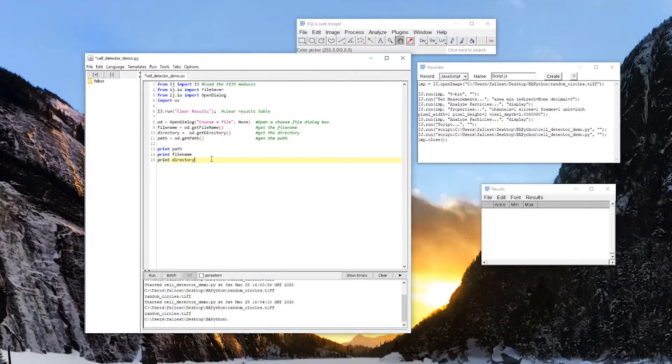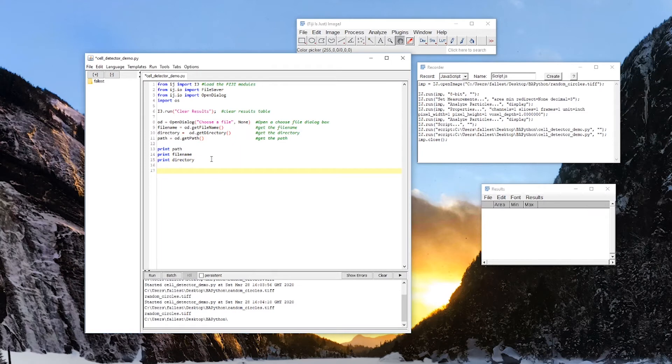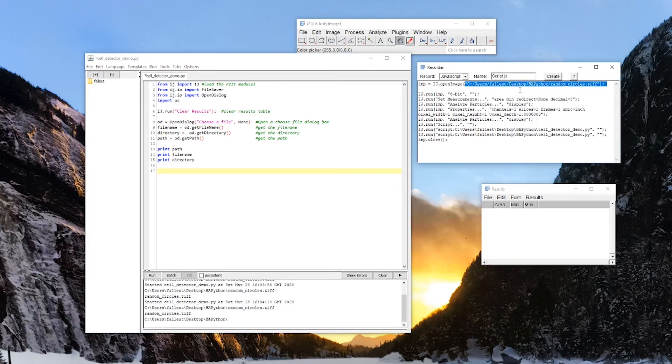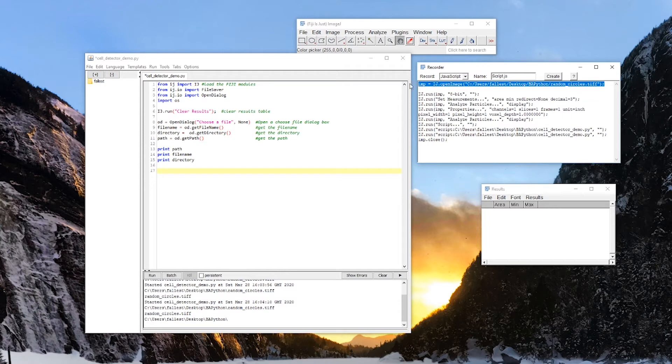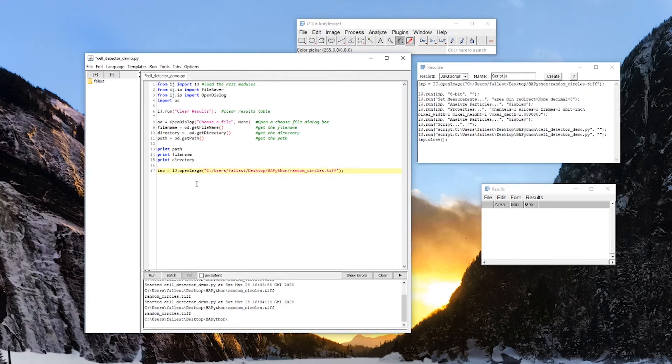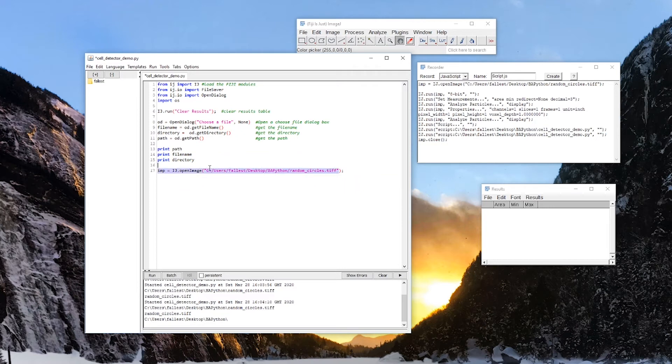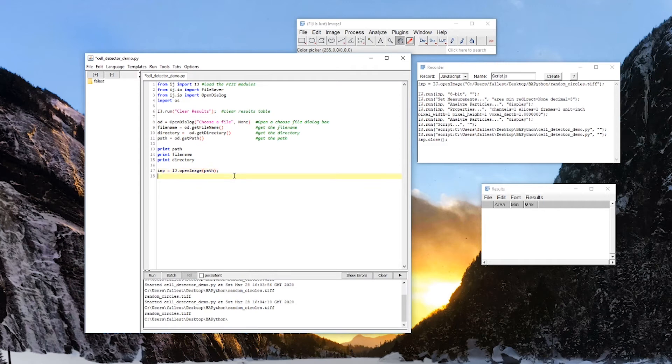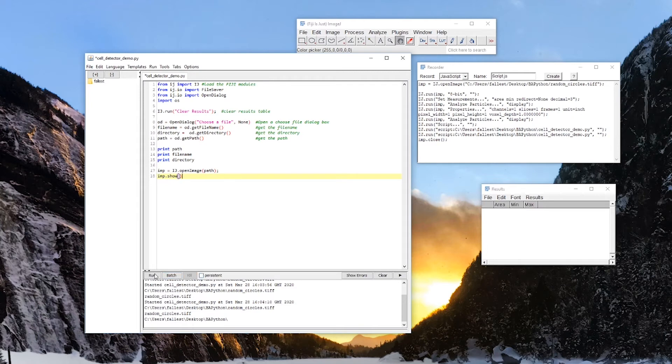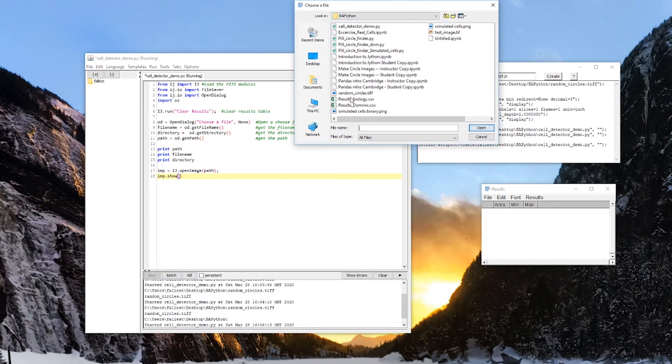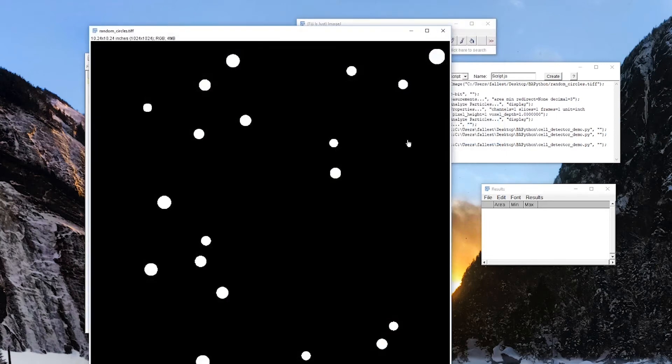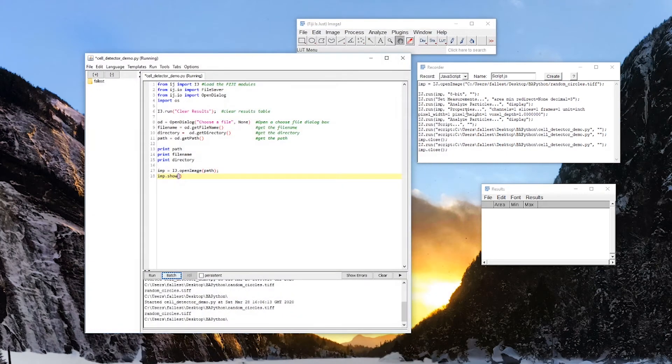So now we can start editing this code a bit. So we can open up an image. So here we see that imp, this is what we're going to call our image, is ij.openimage. And if you look at this, this is just our path, right? So I can copy this over. And ij.openimage. That is a path. So instead of that, I can just write path here. And if I want to show that image, I can just do imp.show. Let's see if this works. There we go. Perfect. You see that it is still running over here, the recorder.